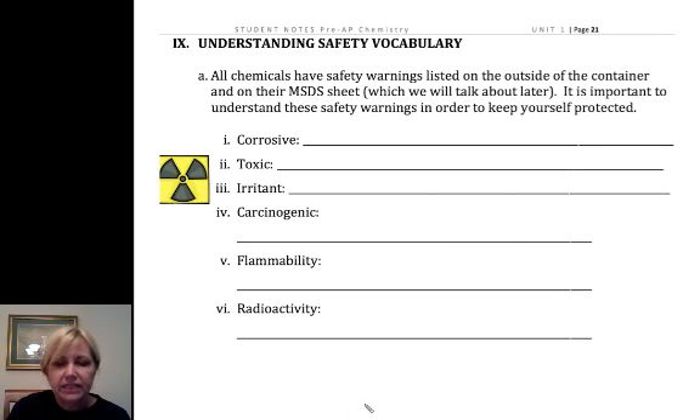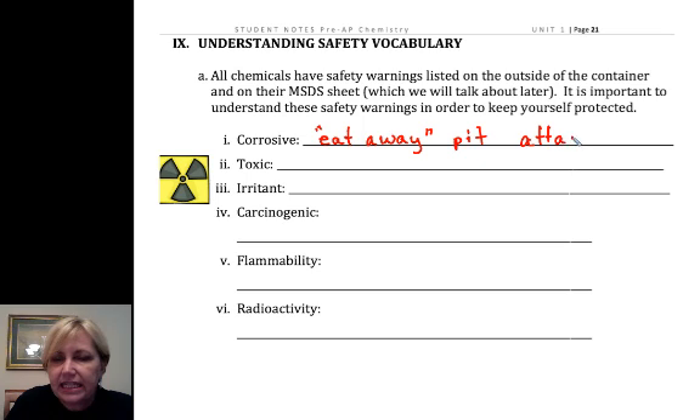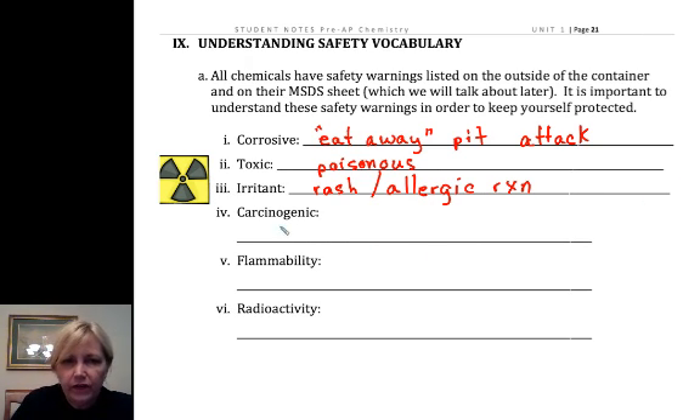For understanding our safety vocabulary: corrosive effectively means to eat away or pit — acids eat away or pit surfaces, and something corrosive is going to attack the skin. Toxic means poisonous — cyanide and arsenic are examples. Irritant means you're going to get a rash or some sort of allergic reaction. If you have specific allergies that you know about, make sure I'm well aware of them. Carcinogen means cancer-causing. Flammable is pretty self-explanatory — it means easily set on fire.